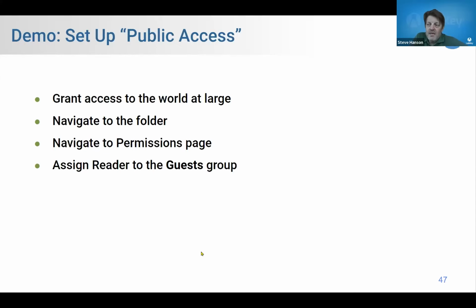You can, however, make it more inconvenient to download data. You can take away that download button. There's actually a way to do that. But if they're smart enough, they'll still be able to download it. Why don't we separate that out? Because it's a little bit of a false promise. If you can see it, you can always take a screenshot of it, right? If you can see the data grid, you can get it.